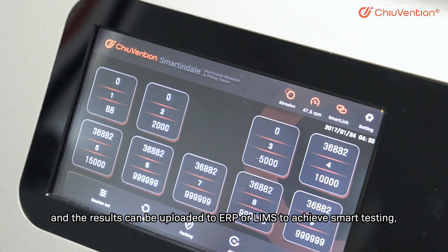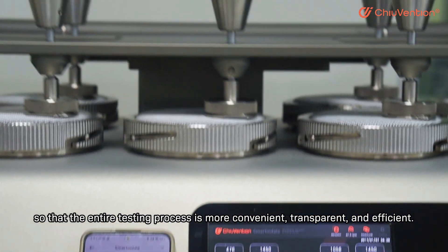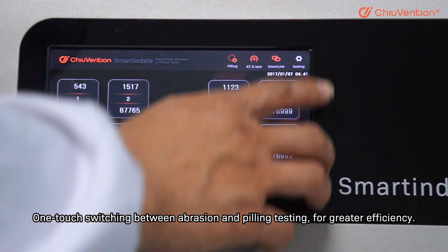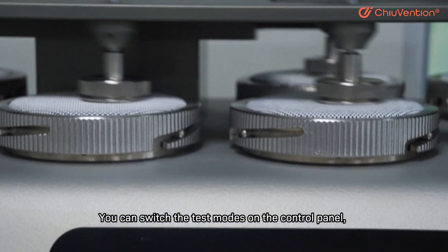Results can be uploaded to ERP or LIMS to achieve smart testing, so that the entire testing process is more convenient, transparent, and efficient. One-touch switching between abrasion and pilling testing for greater efficiency — you can switch the test mode on the control panel.